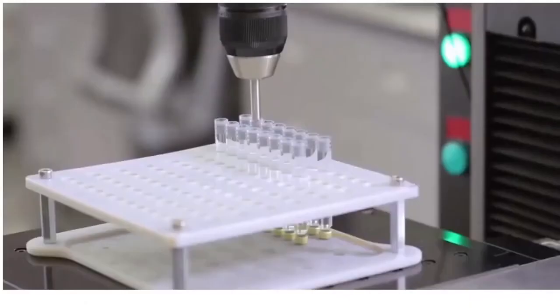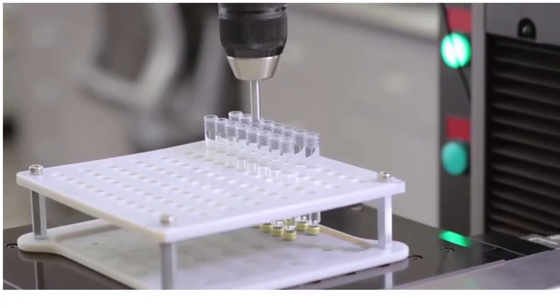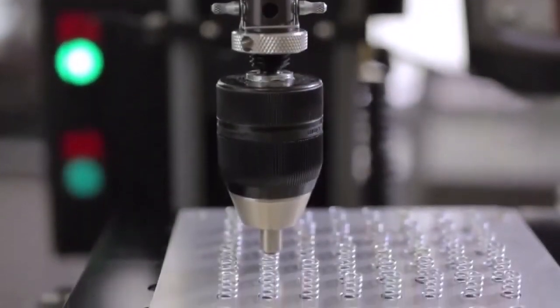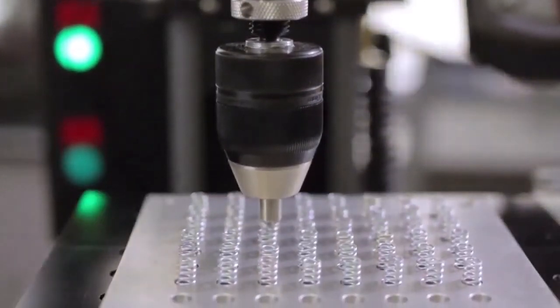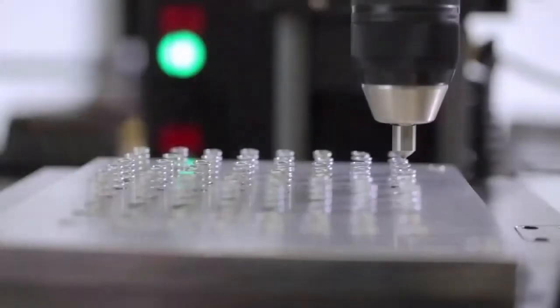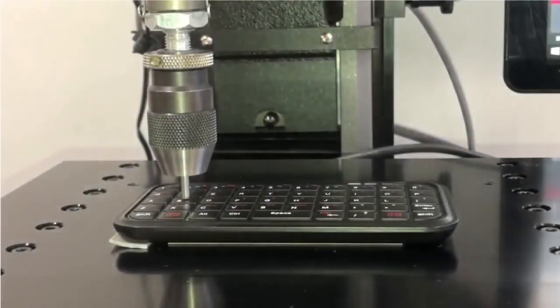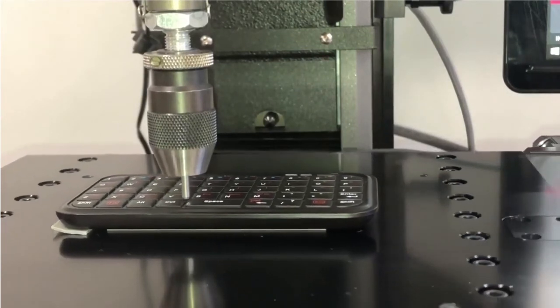Here, liquid leakage tests are being performed on sealed vials. These springs used in a surgical tool are tested to ensure the spring constant is within specification. This keyboard isn't a medical device, but many devices have buttons or screens that are tested to ensure they'll stand up to regular use.